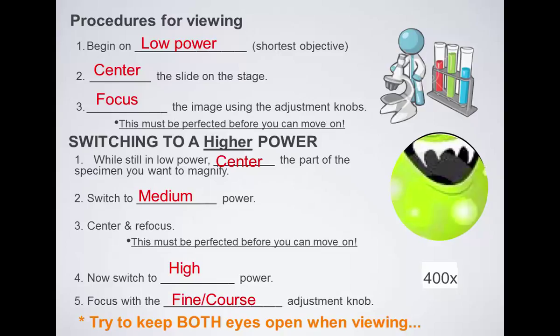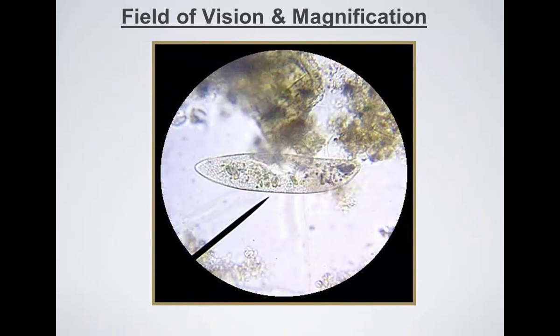A couple last things. You should try to keep both eyes open when you view things in the microscope. I'm not able to do that very well. You can try it. Prevent some eye strain, but if you can't, that's okay. So here I'm looking at a living organism, a paramecia. When you look in the microscope, this is what you see. This is called your field of view. You'll see a little pointy thing in there, a needle it looks like. That's part of the eyepiece. It's not something on your slide. It's built into the eyepiece. And if you rotate the eyepiece, that will move. It will rotate around. You can use that to point out something to somebody. You can say, okay, look just above the pointer so somebody can refer to it.